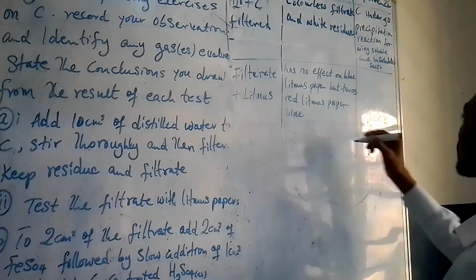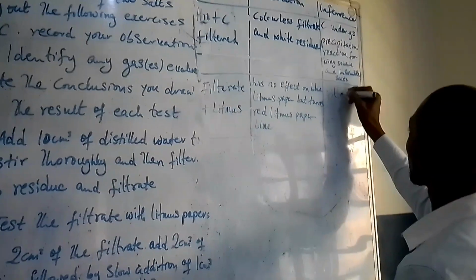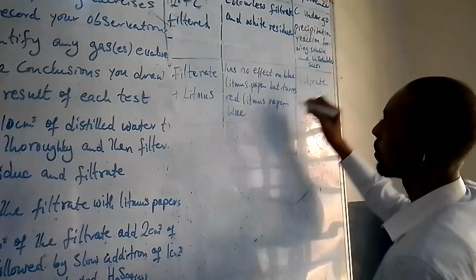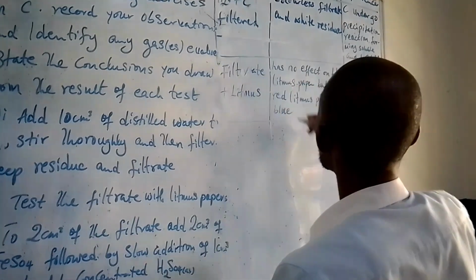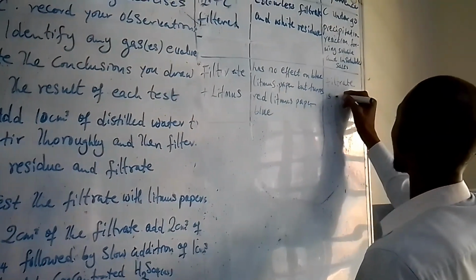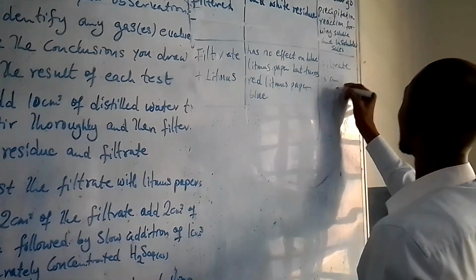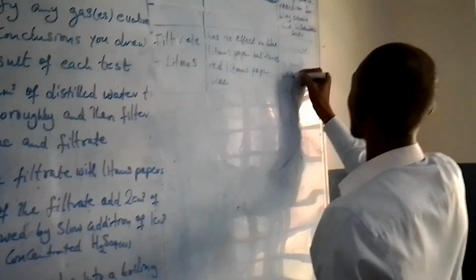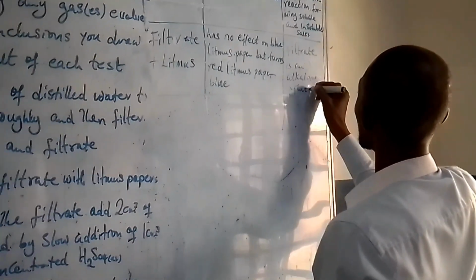When this is done, it shows that the filtrate is an alkaline solution.